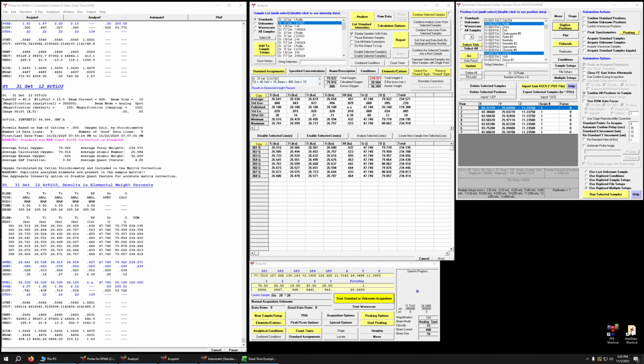So the last thing I'm going to show you is how to update those dead time values in the scalars.dat file, which is a preference parameter file that PFE uses. And we're going to update those with our new dead times that we've just calculated so that every new database you create from here on out with a new method is going to have the correct updated current dead times.